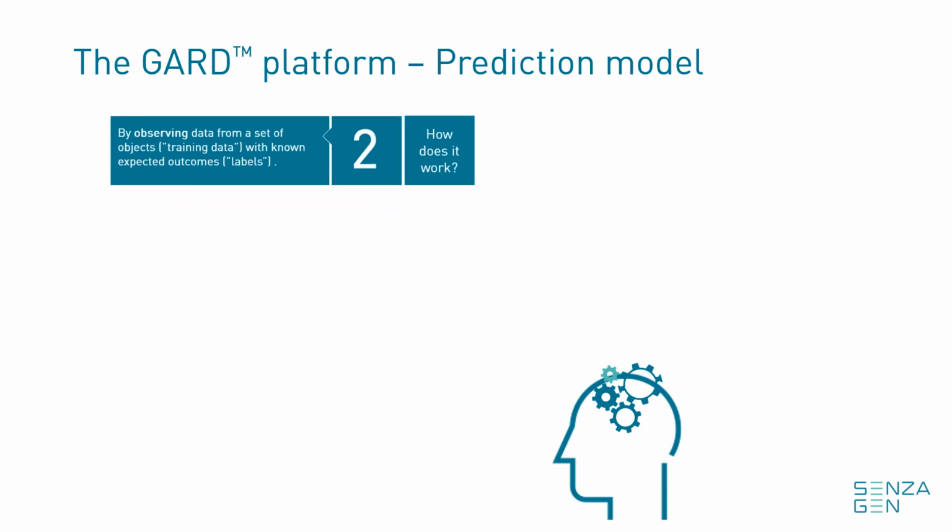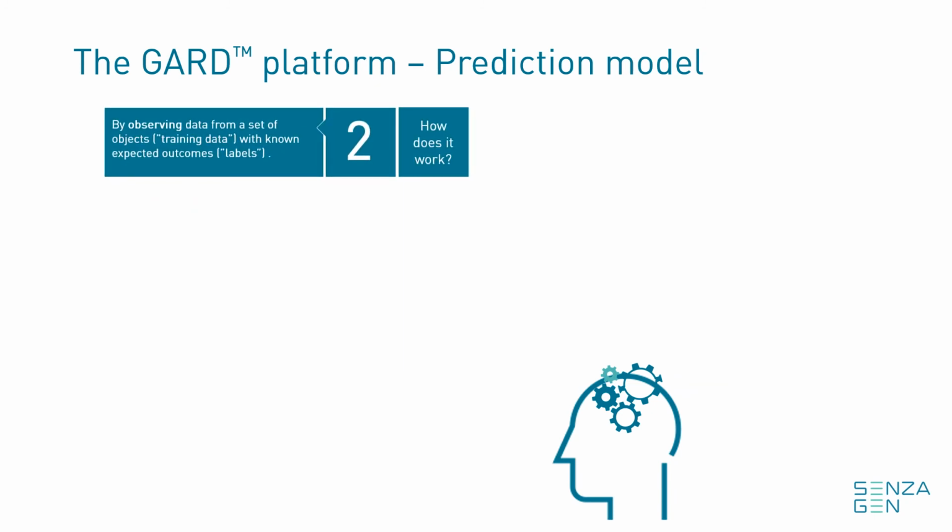To assist in this process, we use a technology of pattern recognition, often referred to as machine learning. In the same way that people learn from their past experiences, a computer can be trained to learn from a set of data. This is the concept of machine learning. Here is more on how machine learning works and how we use this powerful technology in the GARD assays.